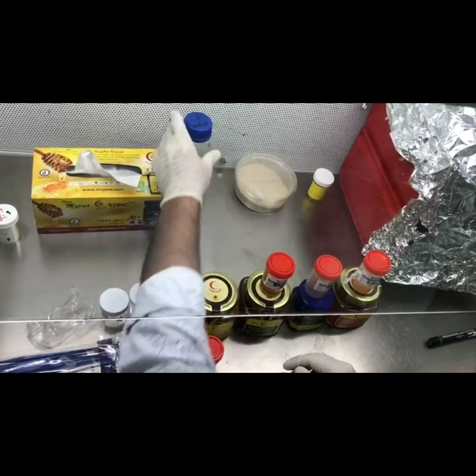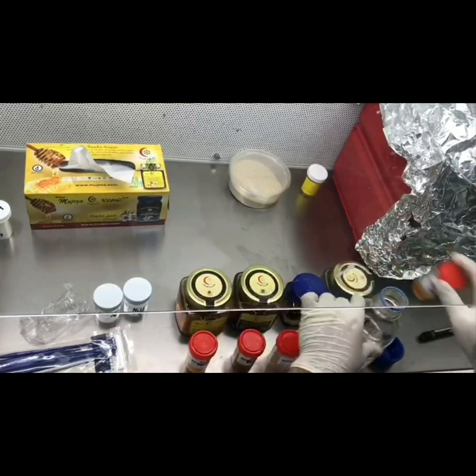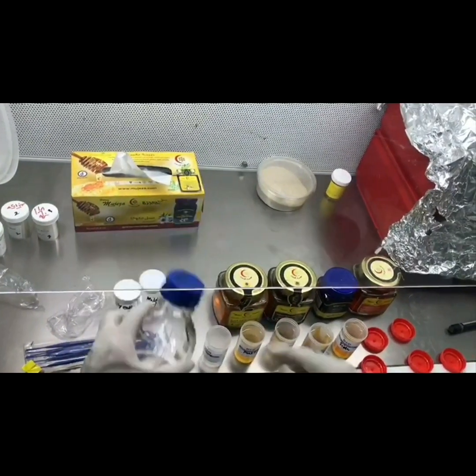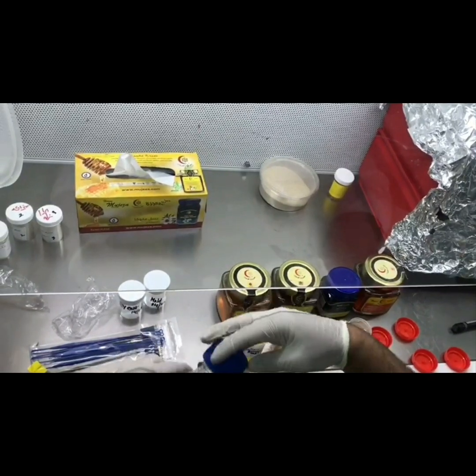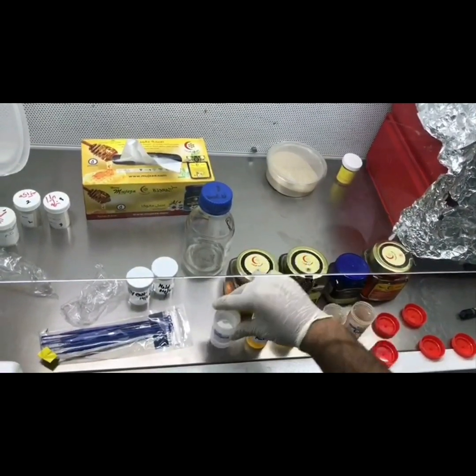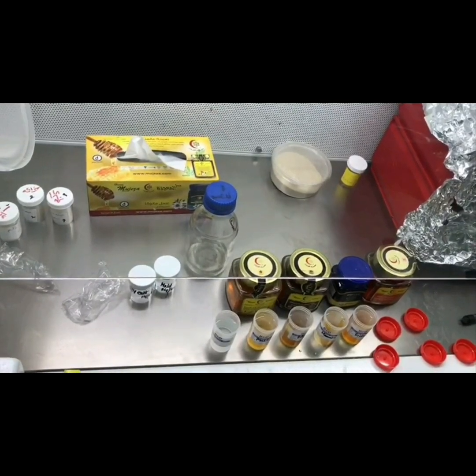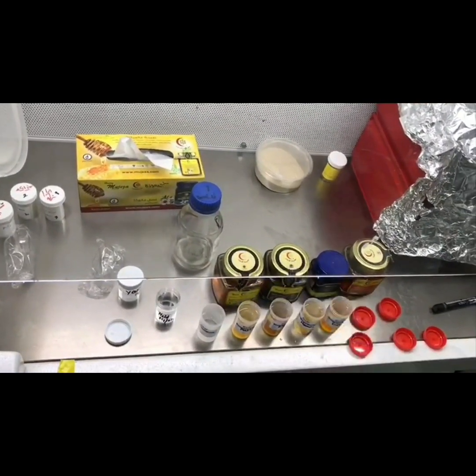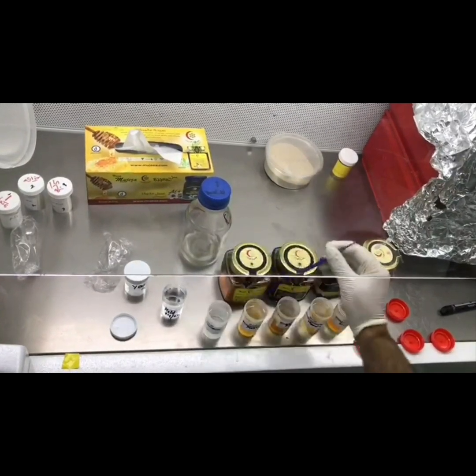To each of the containers I'll add some sterile solution. We have added the sterile solution to each container, and we will also add sterile solution to another container which contains no honey, so that one is the control. Now I'm going to transfer the microbes — I will transfer the molds into the sterile solution, then to the multi-flower honey.